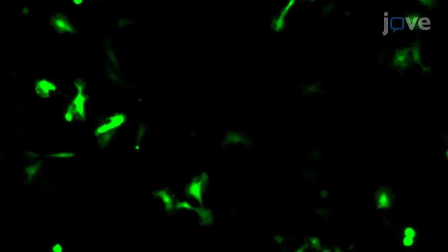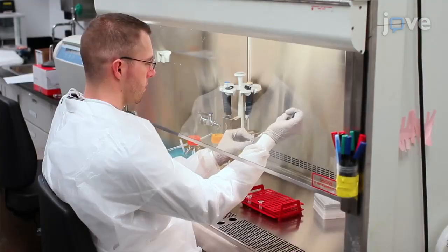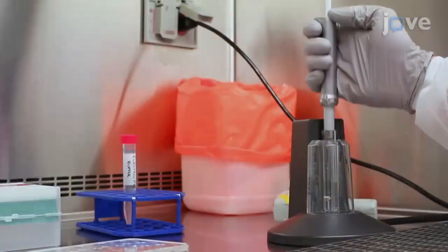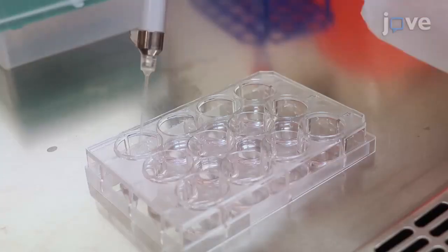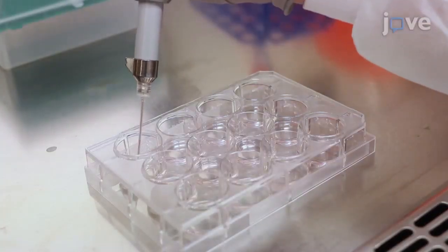The transient transfection of primary alveolar epithelial cells has minimal effect on cell physiology and metabolism, which poses a clear advantage over classic protocols using transcription inhibitors.